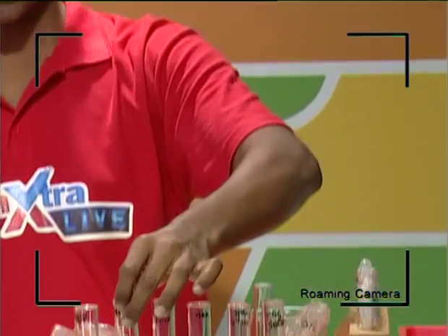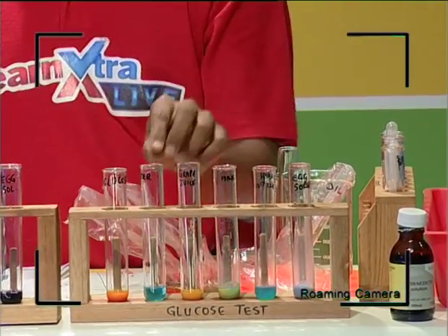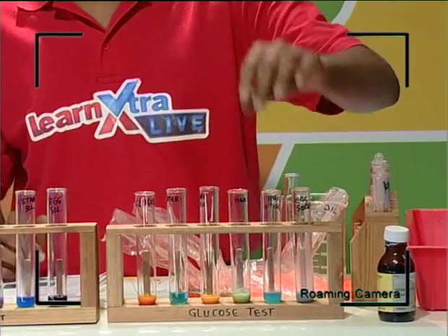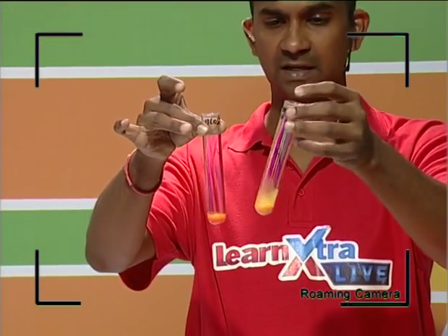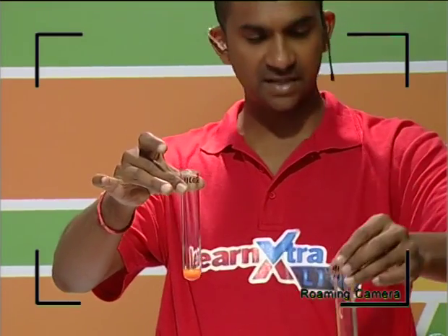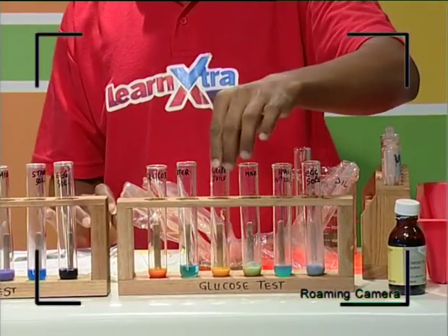So we can look at these as our two test tubes to compare, and that's why we call this the positive control and this the negative control. The first sample we tested, guys, was grape juice, and we looked at the color. If we compare this to glucose, you can clearly see a similarity in color, a tinge of orange in it, not as dark as this, indicating, yes, a positive test for glucose. So we tested positive for glucose in the grape juice.